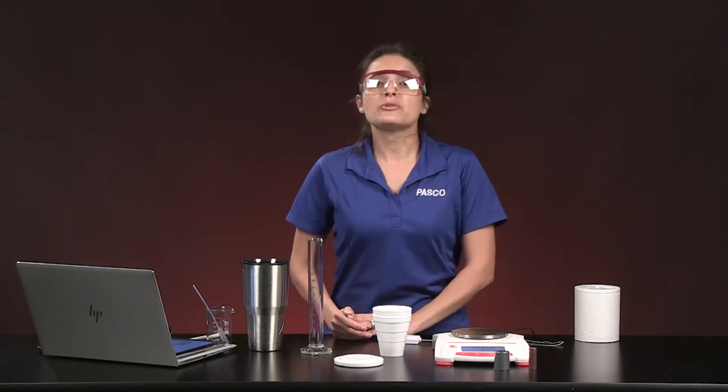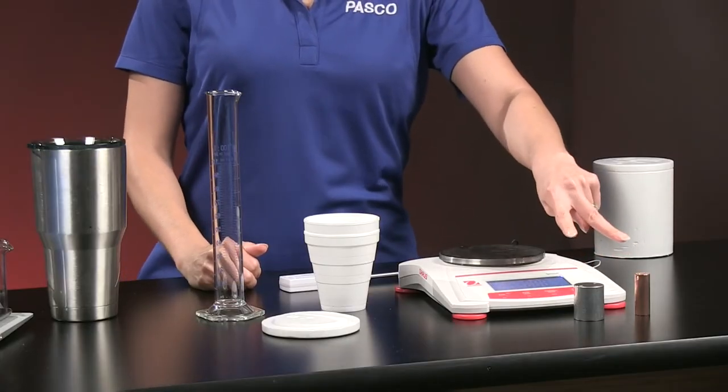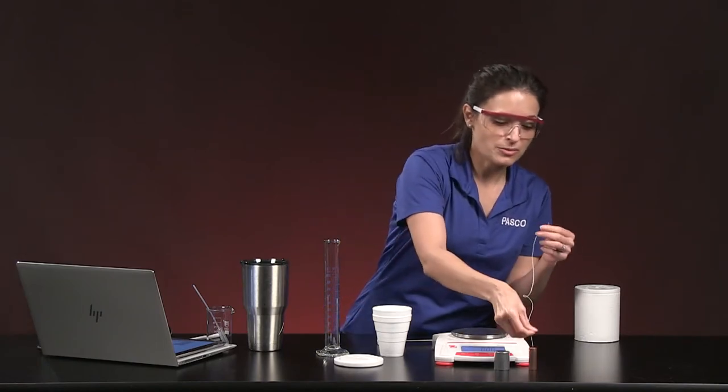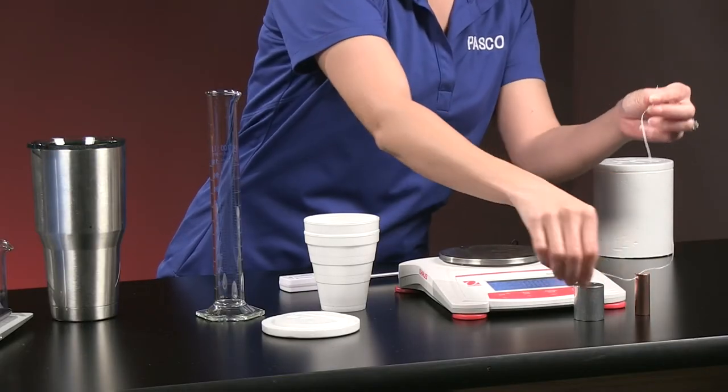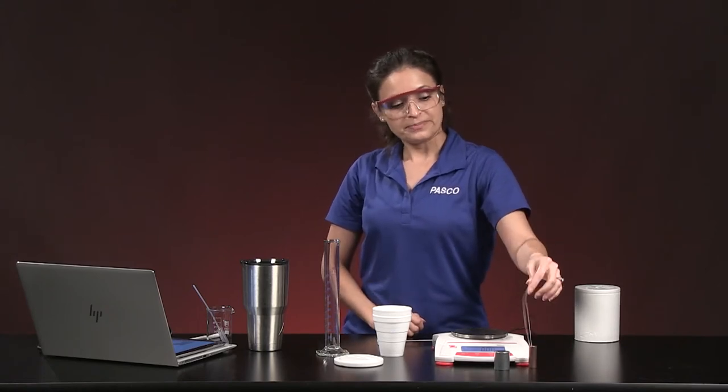We're using the ability to hold or transfer energy to determine the identity of an unknown metal when we put a piece of metal in a calorimeter with some water. Here are the materials we need. I have two metal samples — don't know the identity of them yet. I have a digital balance and a piece of string, because my metal samples have a hole to thread a string through.